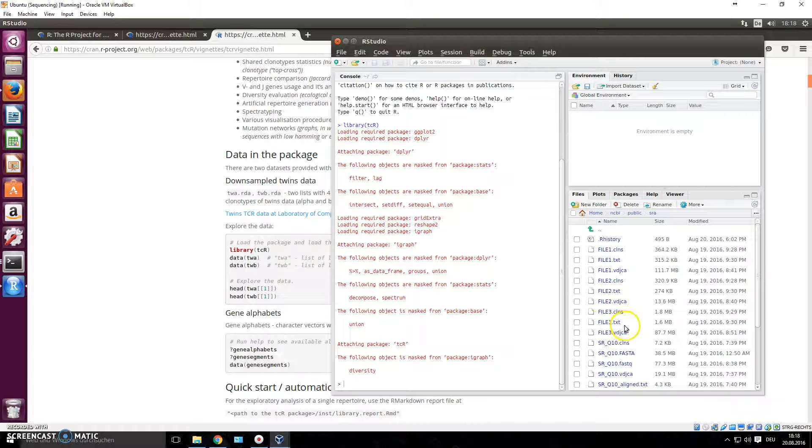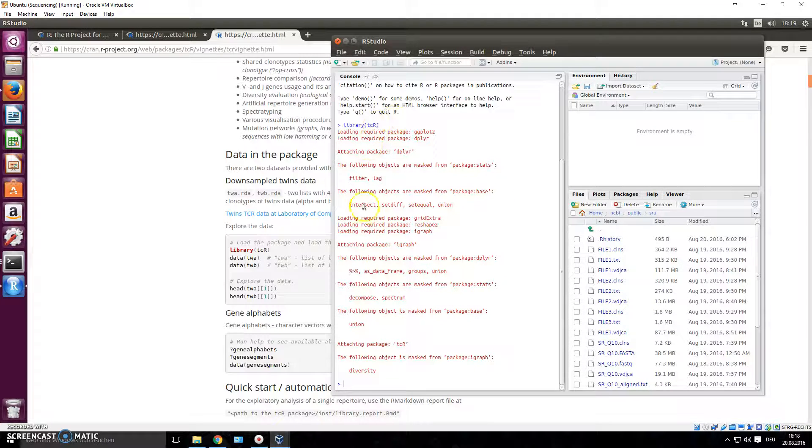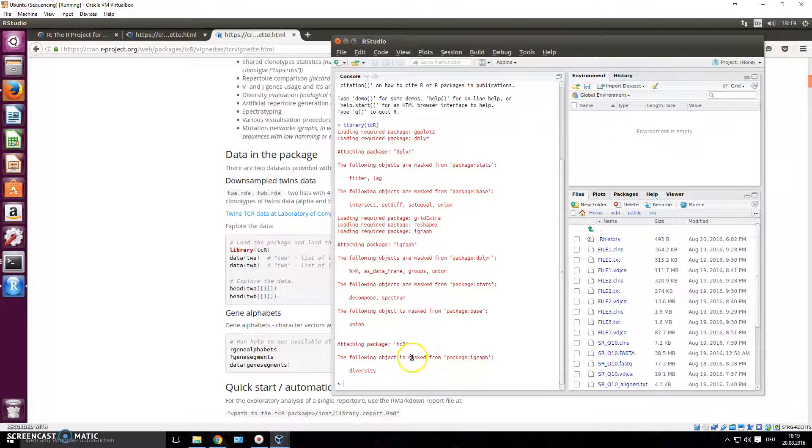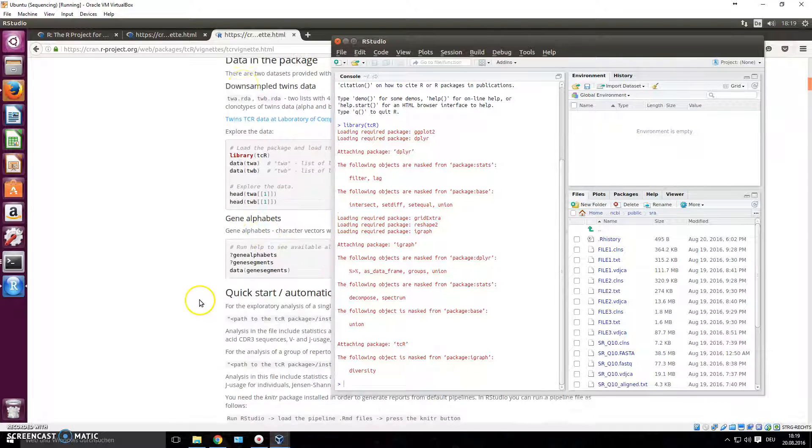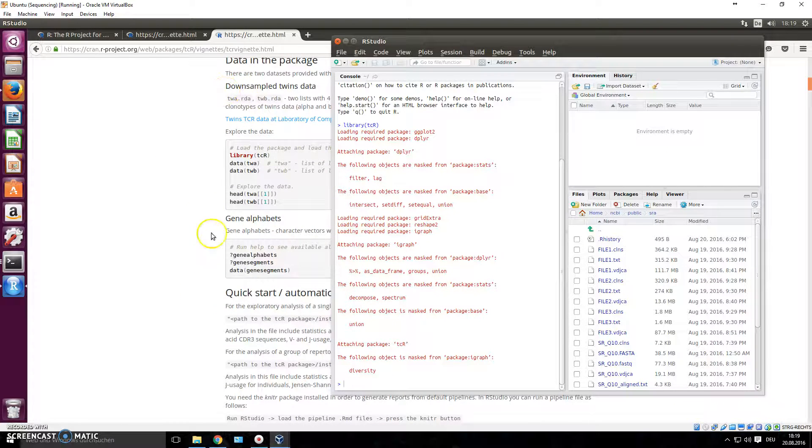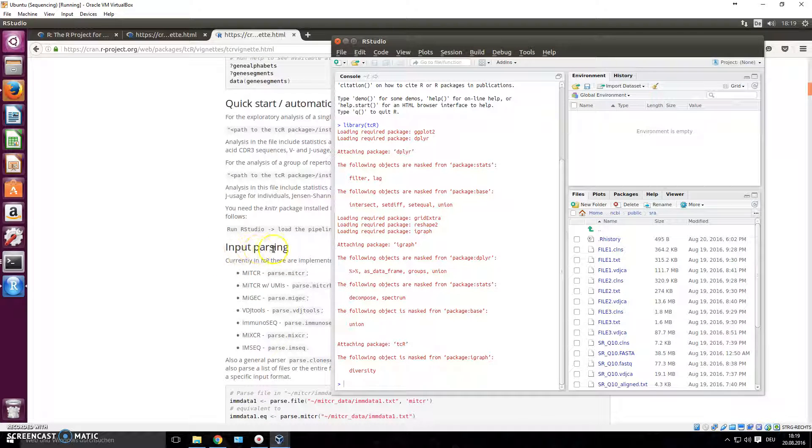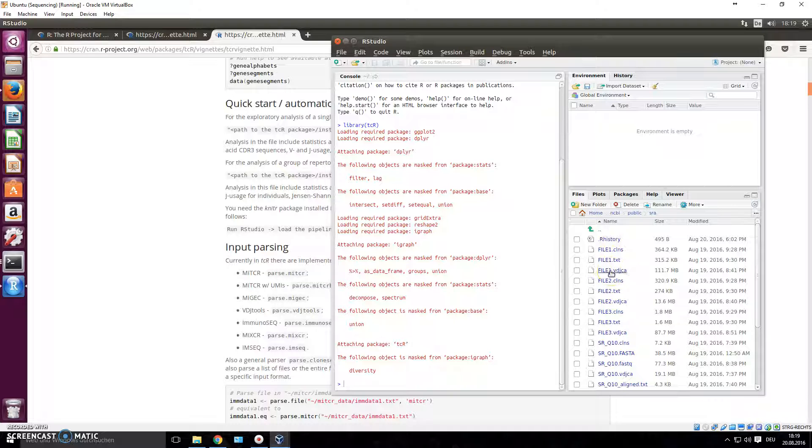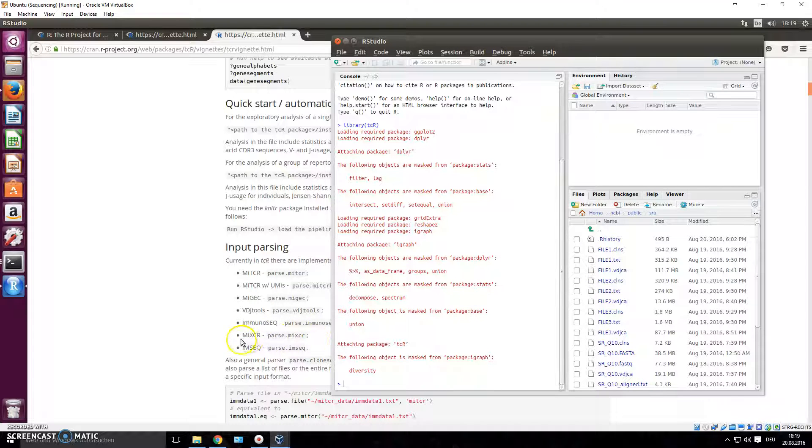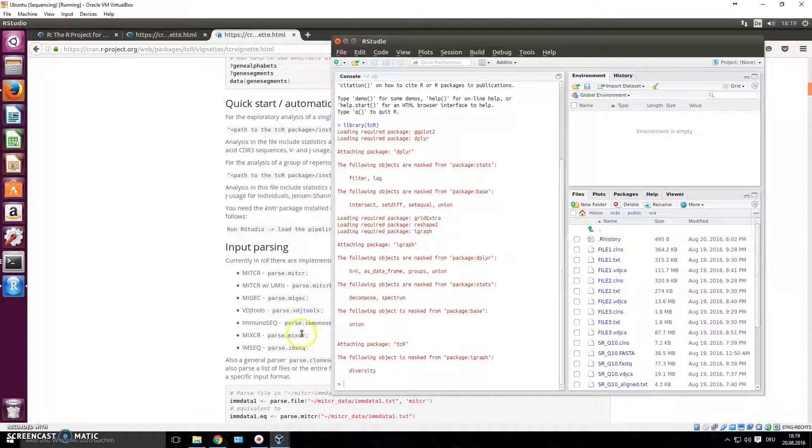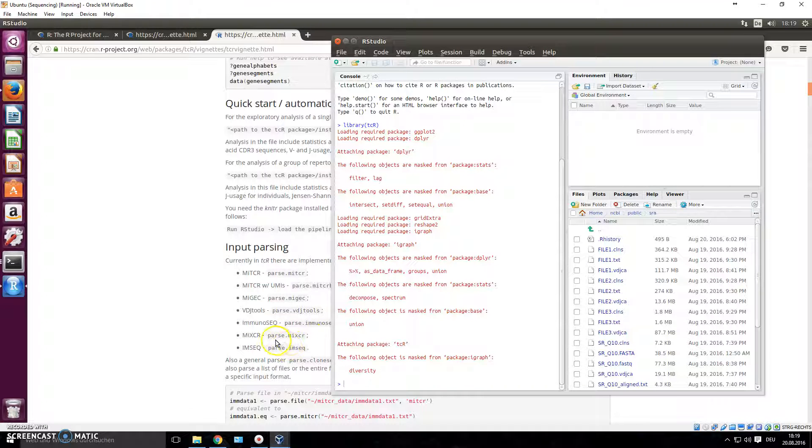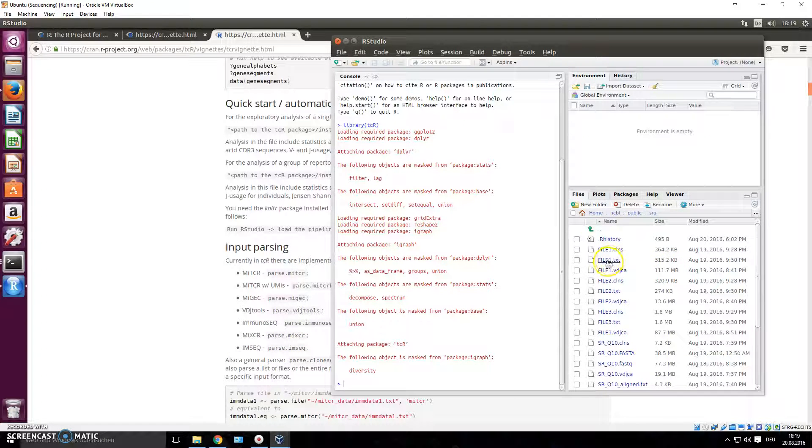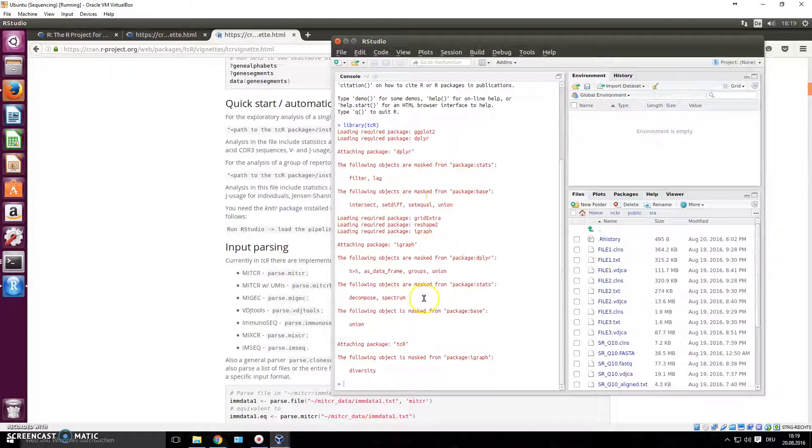And we will now load this into this package, into our global environment. For this we go through the documentation and there we read that input parsing - this is what we need to do. We have these files that we've aligned with MiXCR, which is one of the supported file formats in tcR, and we need to parse this now. So it takes the format of this file and it changes the format to be able to work with tcR.